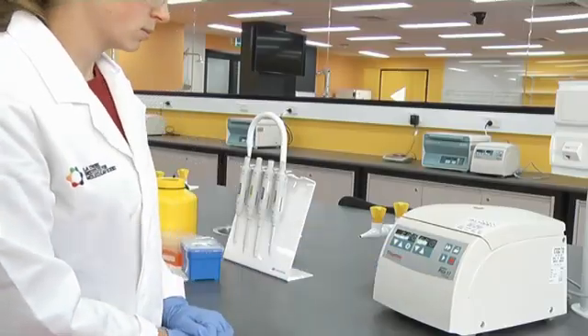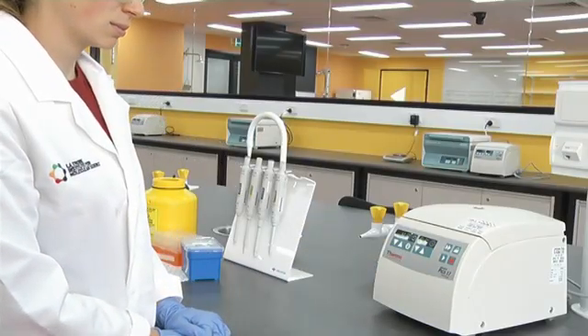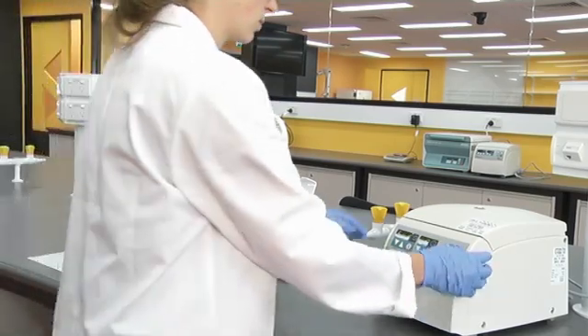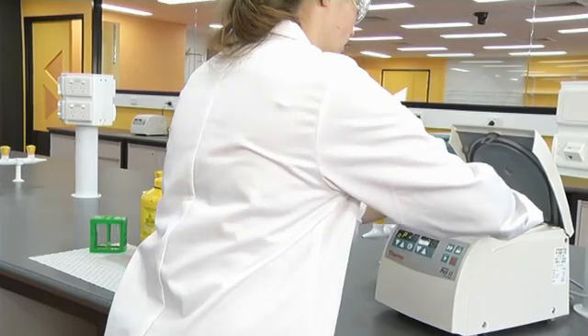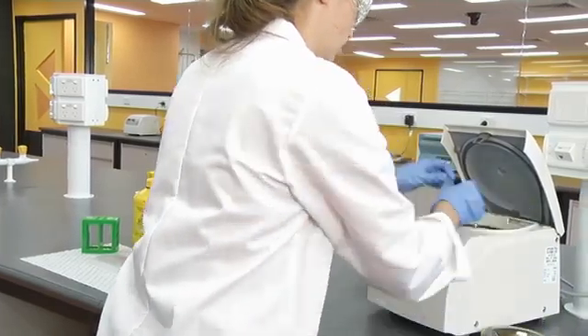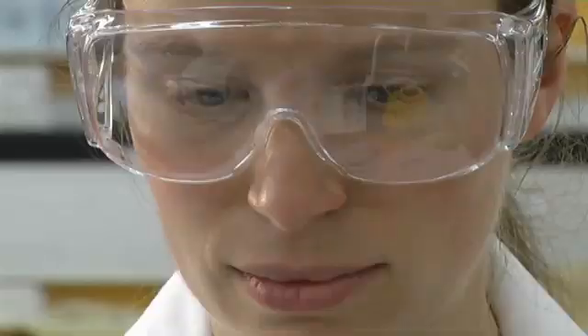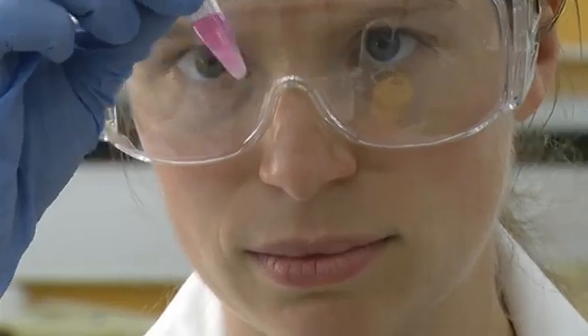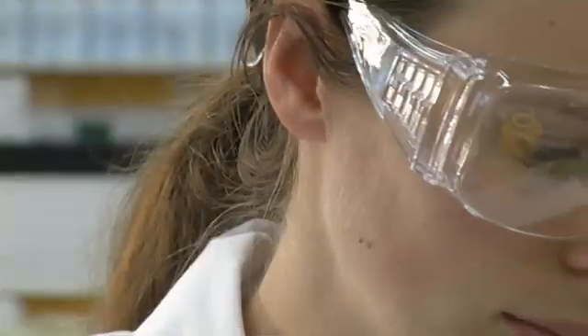Often it is necessary to estimate volumes of small amounts of liquid, especially when removing a supernatant from a tube. This can be accomplished quickly and accurately using your automatic pipette. Have a close look at the liquid in the tube and estimate the volume by eye — in this case, about 500 microliters.